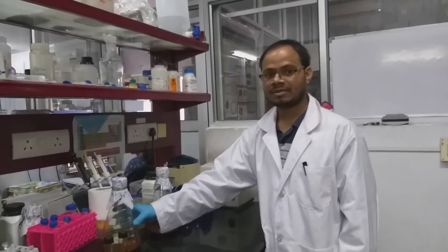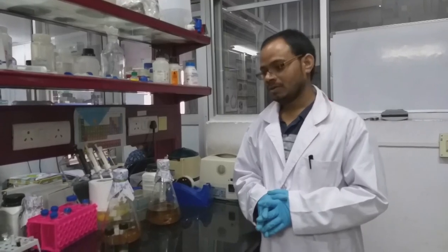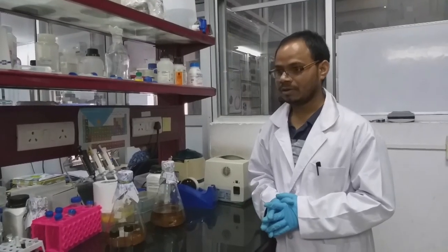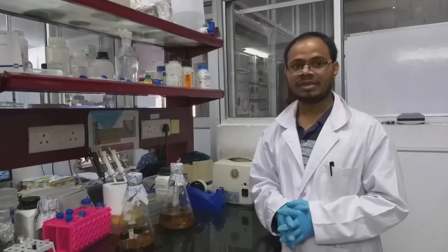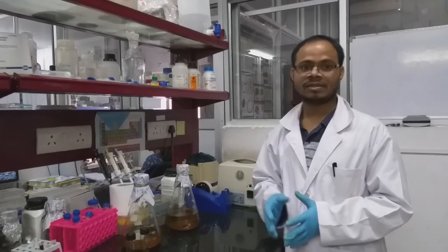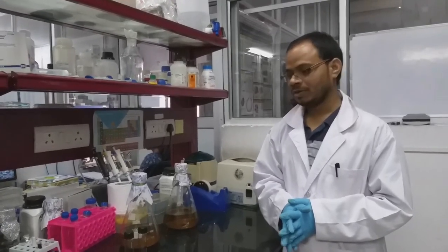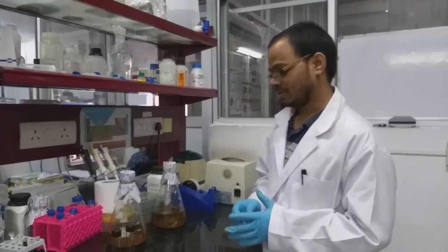inoculating into large cultures. This process should be done in aseptic condition, so we have to use laminar airflow for this purpose. Also we have to remember we should include a suitable resistance marker like ampicillin or kanamycin, depending upon what resistance vector you are having. In this case we are using ampicillin as the antibiotic. So let's start.